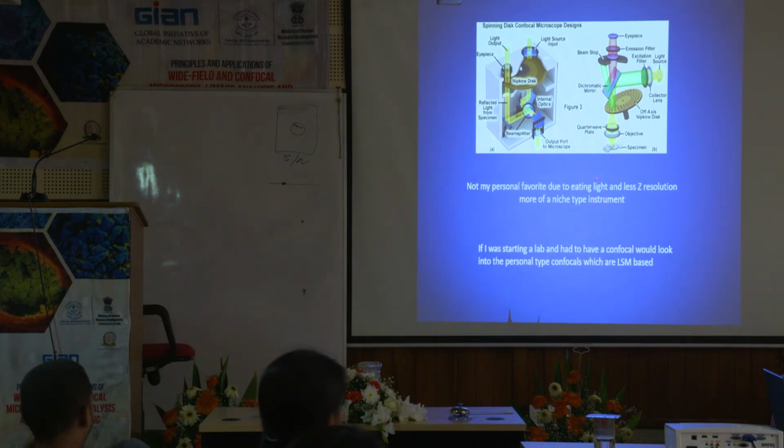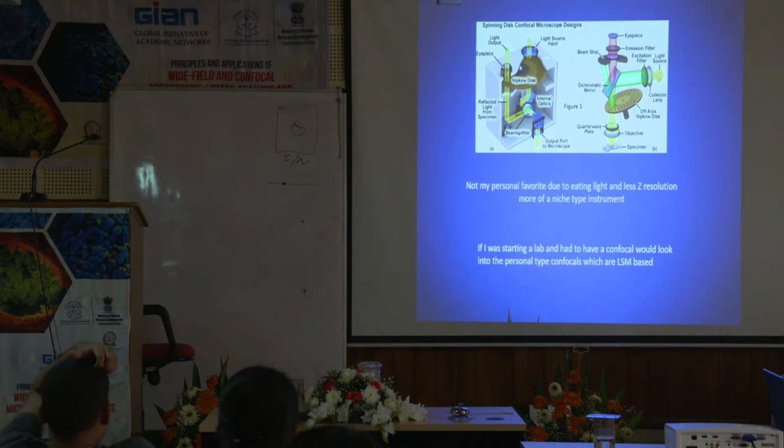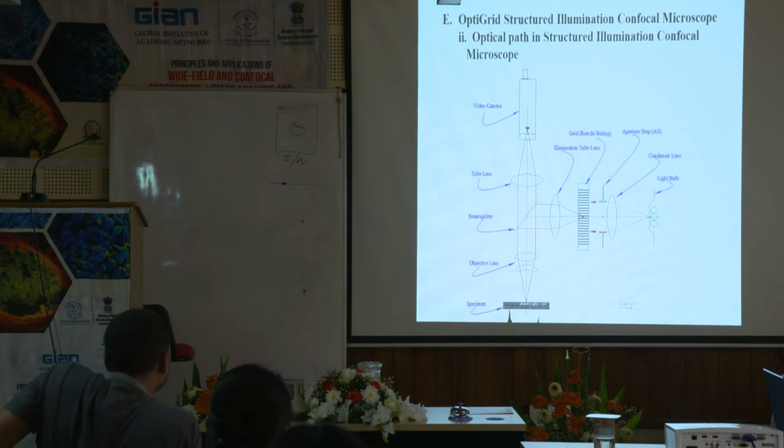But if you're going to do live cell all day and that's all you're going to do, it's not a bad deal. But if I was just starting a lab, getting my first confocal, I'd probably go with the laser scanning, just for the quality and everything else. But if I was going to do live cell all day, I might go with this. Everything's application dependent. So let's look at another one.